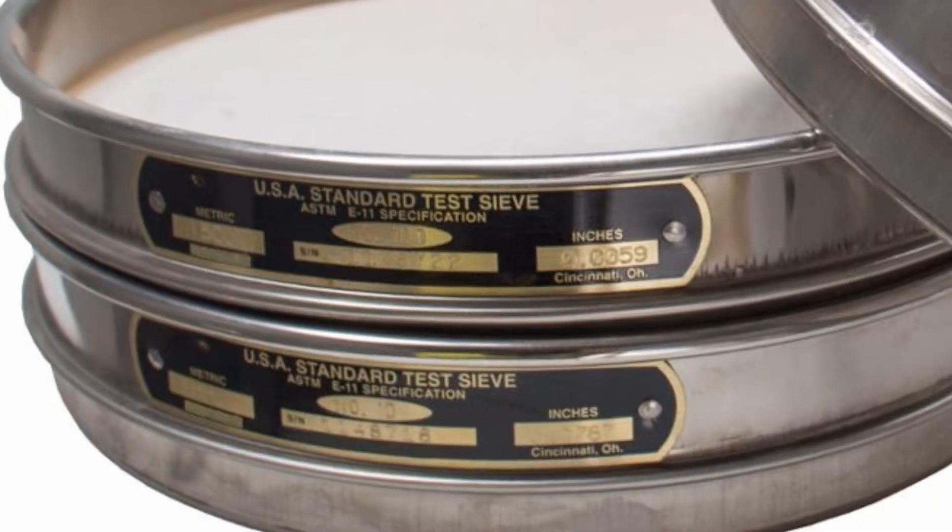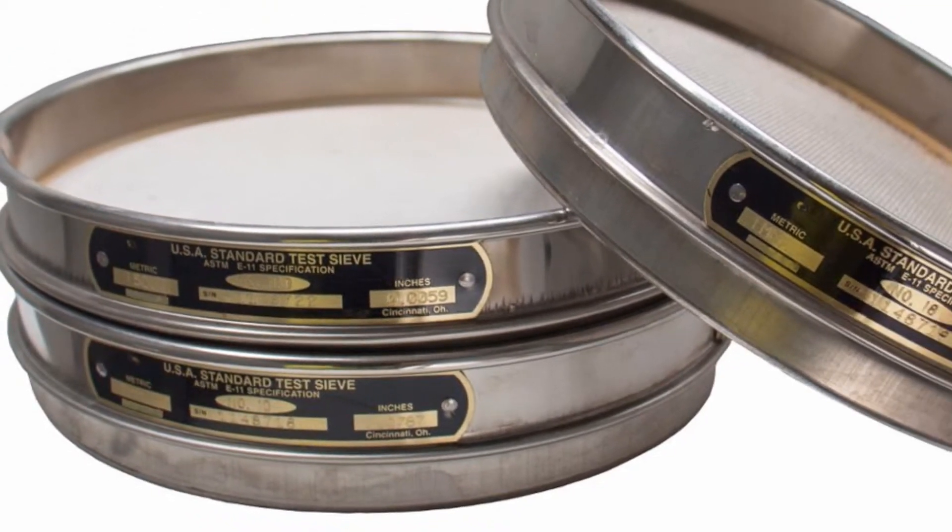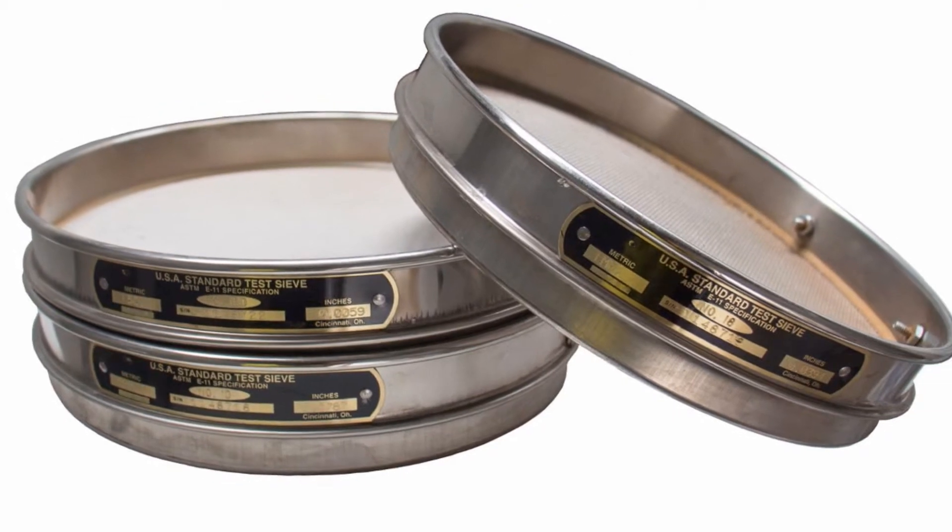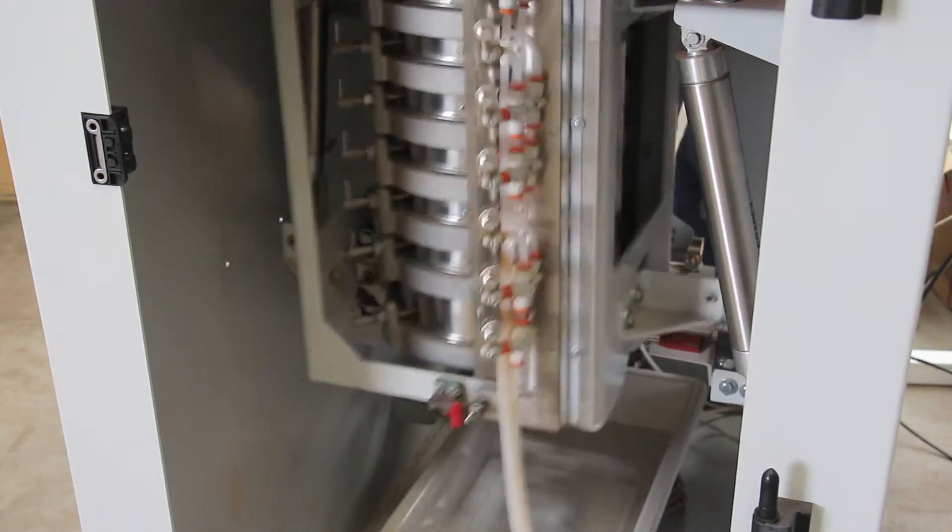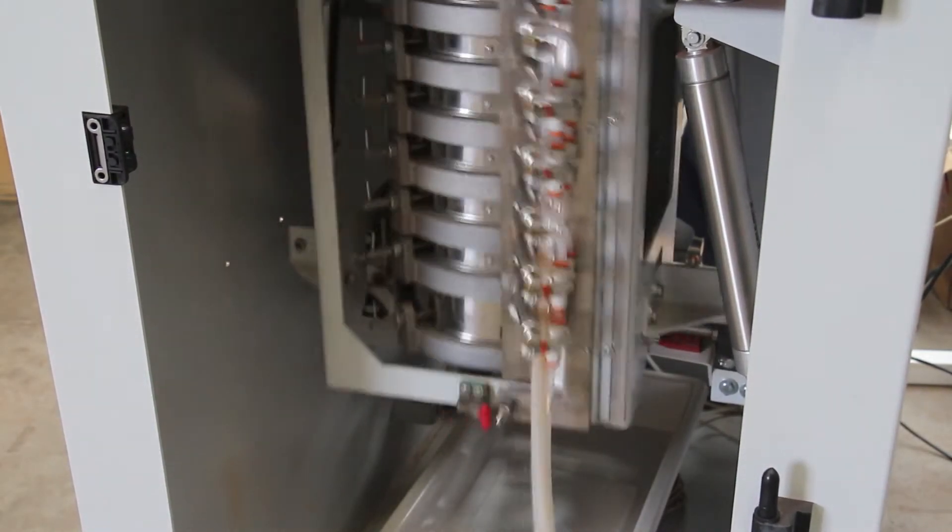The Sievemaster uses standard or half-height 200mm circular test sieves which can be easily inserted and changed to suit specific test requirements. It shakes and taps for a preset amount of time using the same stroke and frequency as typical manual shakers.